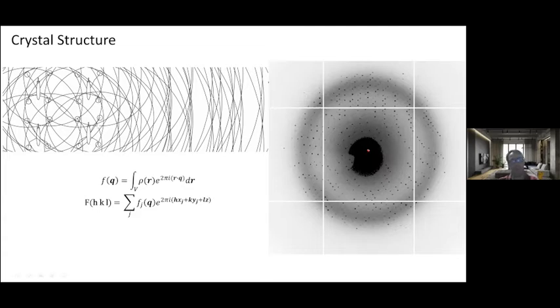And because of the relative spacing of these water striders, you get spots on a grid related to where these are positioned. And you can see the sort of how the grid is in these HKLs.